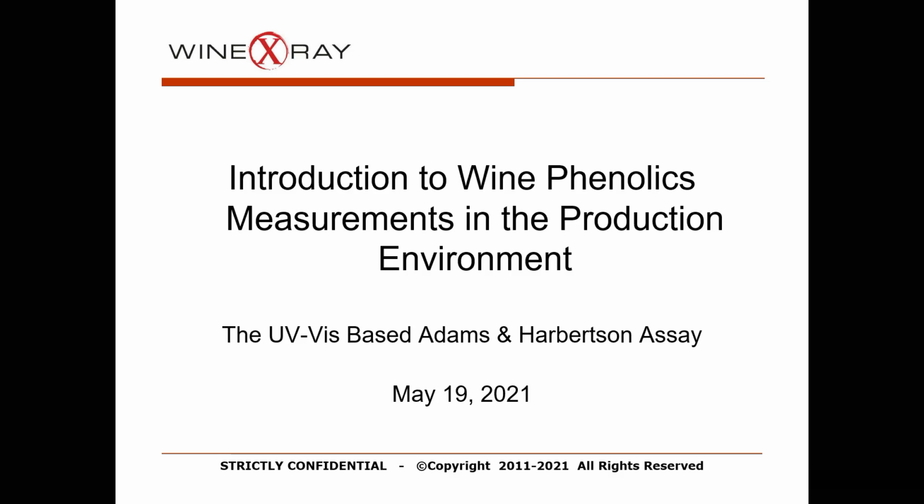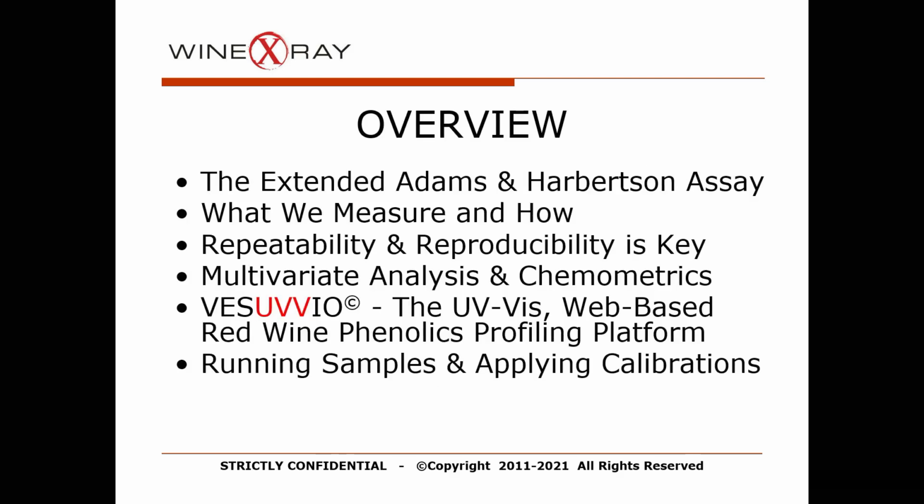So I'll give you an introduction about what we do, how we do it, and how this will help you interpret some of the numbers that we're going to show you. When we talk about phenolic measurements, it's something that is really important to great red wine making, and analysis is really important to the understanding of that process. As an overview, we use what's called the extended Harbertson-Adams assay, or Adams-Harbertson assay, created by UC Davis's Dr. Doug Adams and grad student Jim Harbertson, who's now on the staff at Washington State University. We'll tell you a little bit about how we measure it, why, and how we do it.